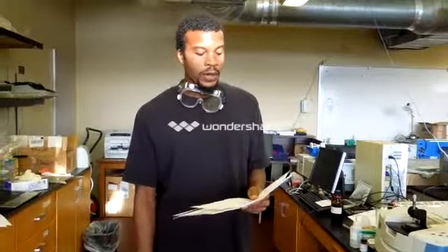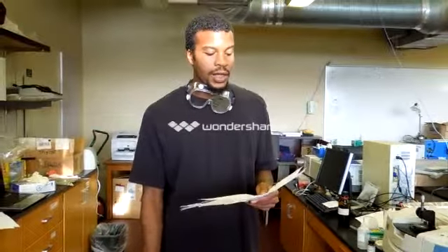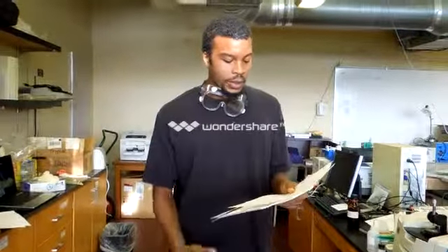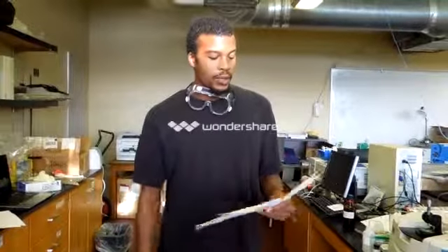The data is going to be given to you in the form of spectra, which show peaks at frequencies of light that are being absorbed. There are interatomic vibrations that are actually bending and stretching, and regarding the correlation between the atom size and the vibrations, the bigger the atoms, the lower the frequency being absorbed.